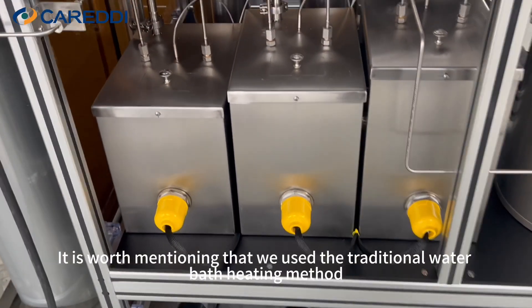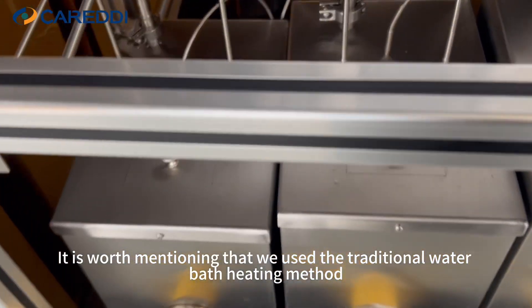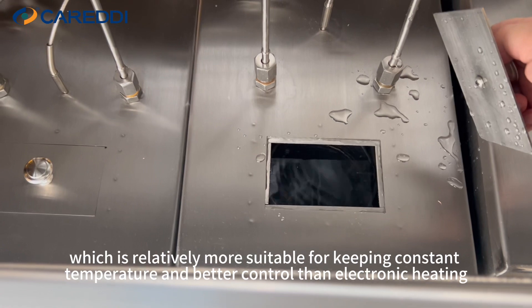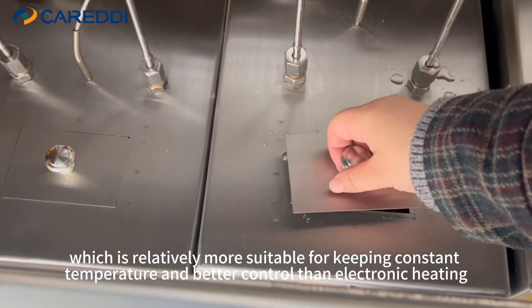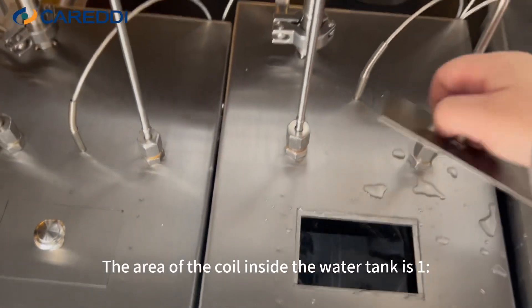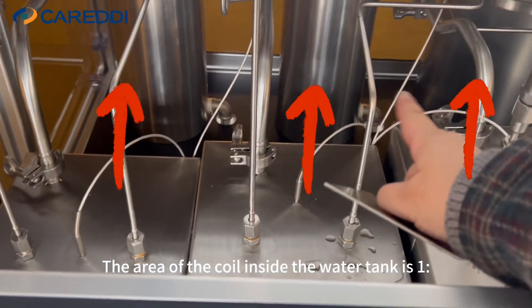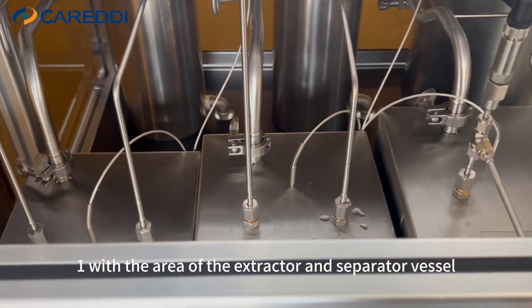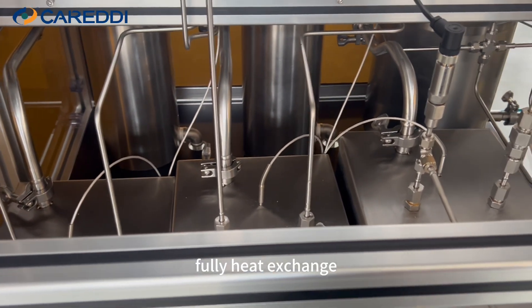It's worth mentioning that we use the traditional water bath heating method, which is relatively more suitable for keeping constant temperature and better control than electronic heating. The area of the coil inside the water tank is matched one-to-one with the area of the extractor and separator vessel, ensuring fully effective heat exchange.